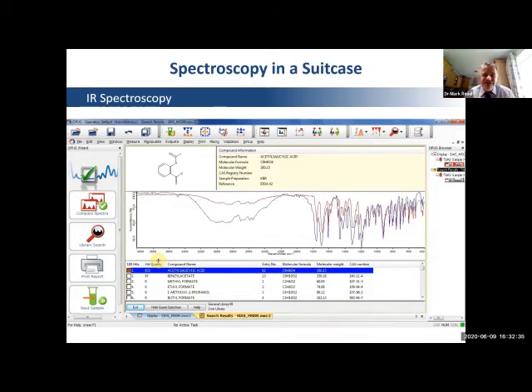So that shows you how we can use this infrared in a very rapid manner. I haven't destroyed that sample, so if I wanted to, I could take it off and run another instrument, using NMR, for example, or in forensics, that could be sealed up as evidence as well. I've not destroyed the sample. So that's another advantage of the infrared technique.